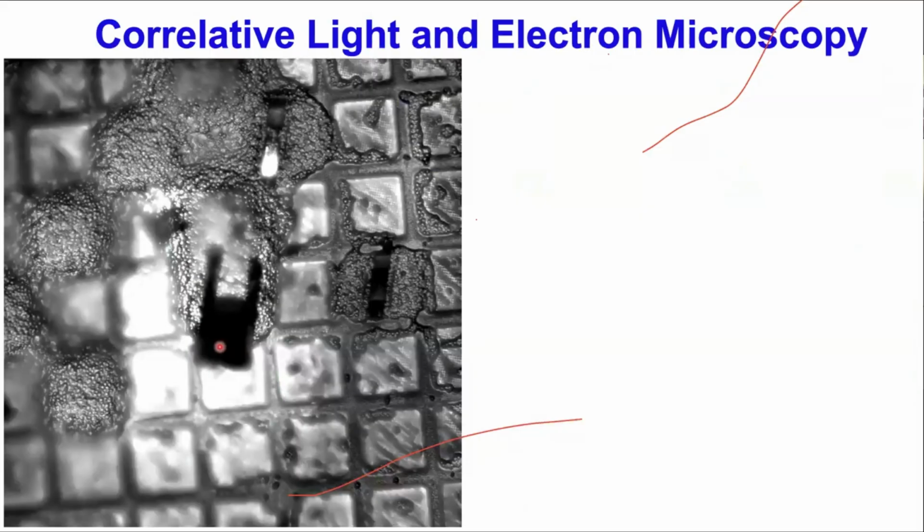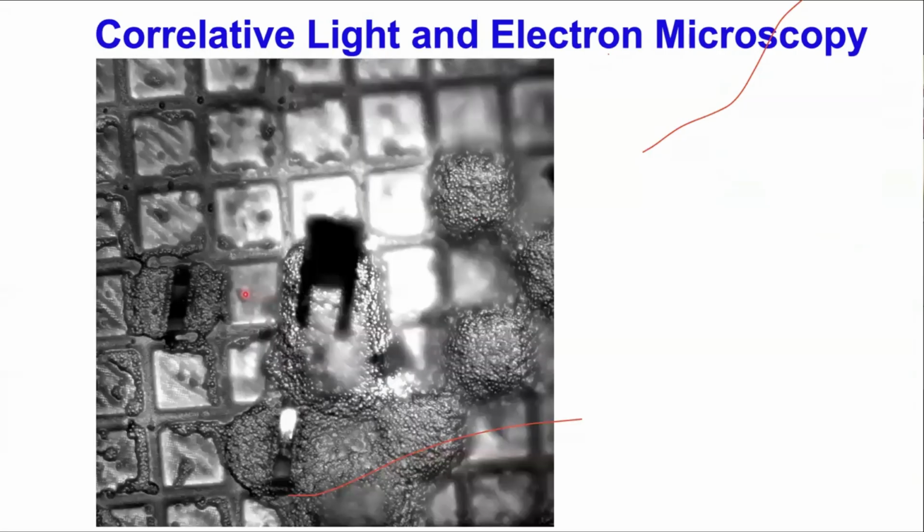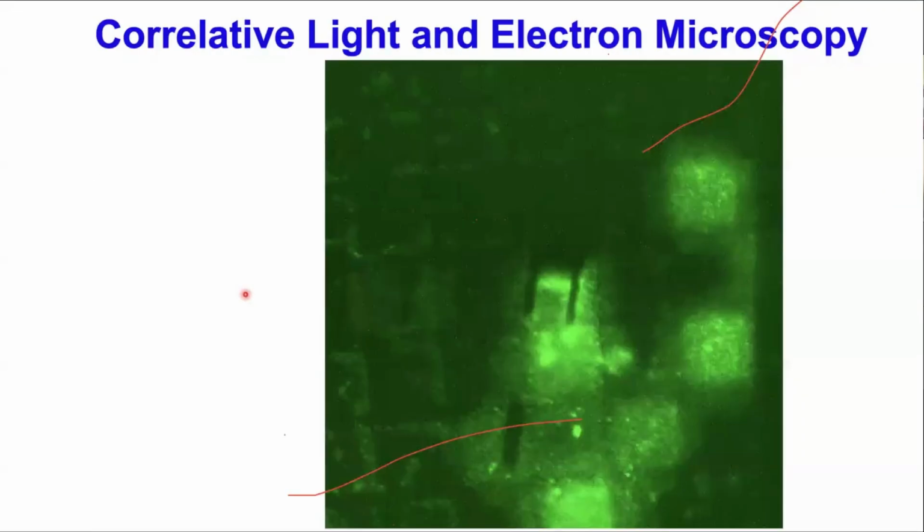We have another slice and view option. See how it looks under light microscopy or the DIC image. And finally, once we merge both images, you can see that this is our area of interest where we can generate the data.